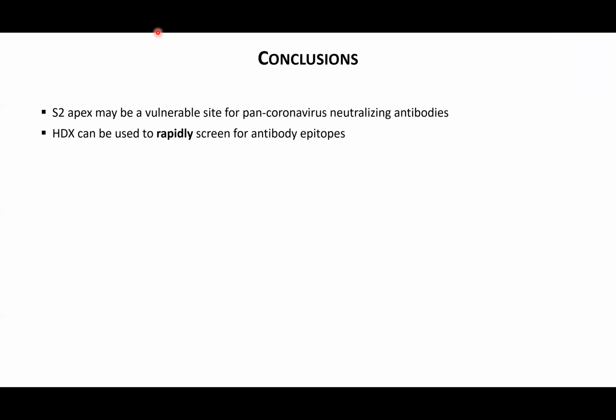Yeah, hi, Sheena. Tony Purcell from Monash. Hi. And I apologise in advance. My phone rang halfway through your presentation on the coronavirus stuff. So if I missed it, you know how it is nowadays. It's a bit crazy. But I wonder if you can comment on the sorts of affinity required for the antibodies to so confidently map these epitopes, and the potential for looking at discontinuous epitopes as well, and how well you think you map those sorts of epitopes.